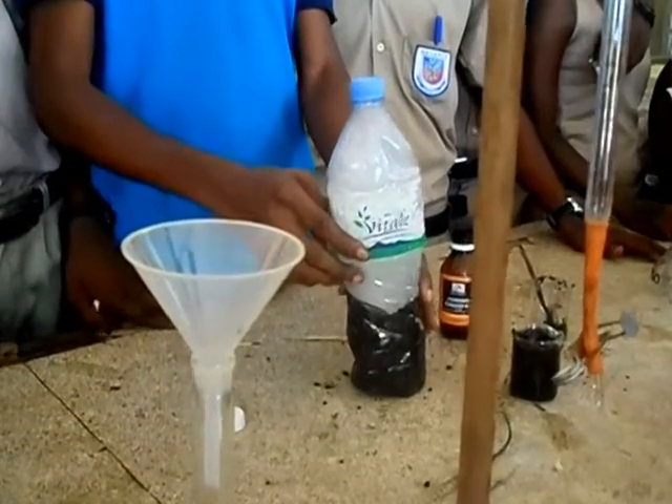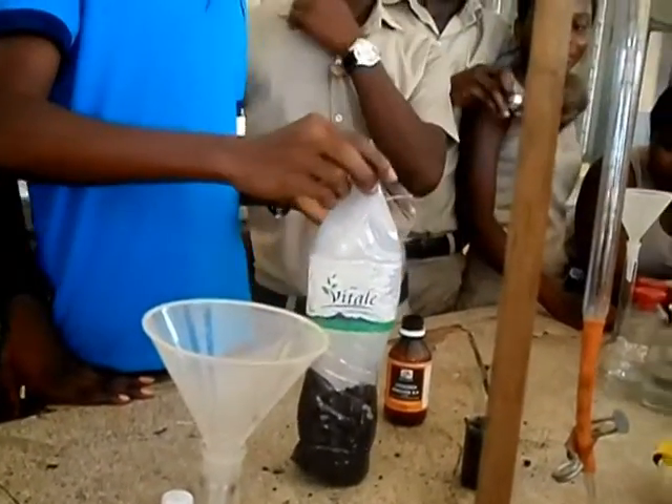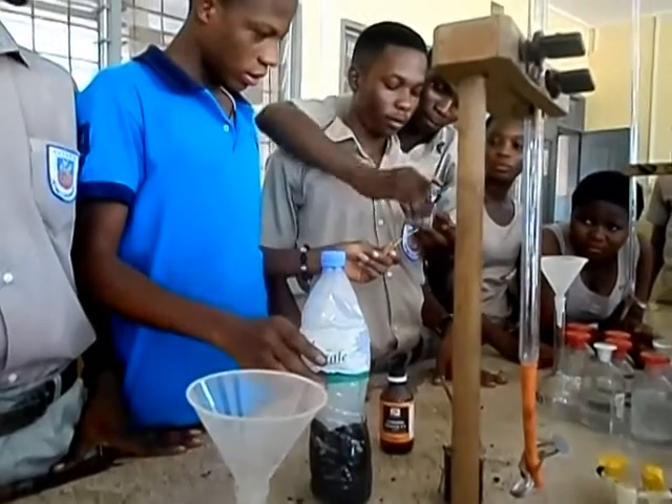You light the glowing splint before inserting it. So now we are going to light a glowing splint. I need wood. Yes, we light it.